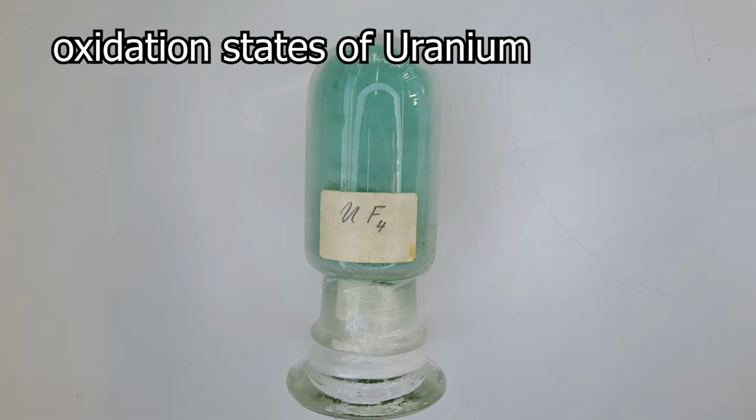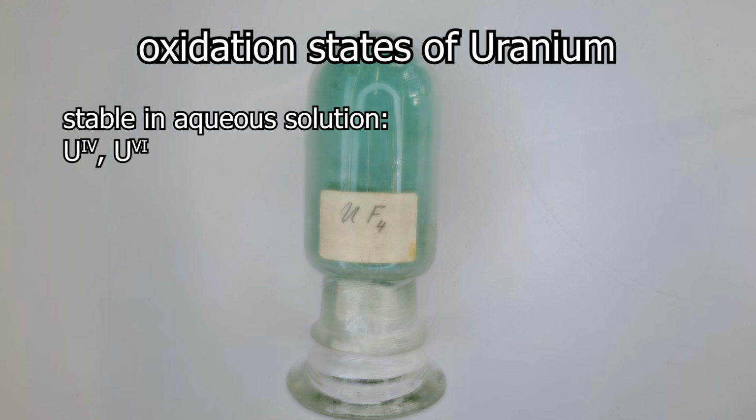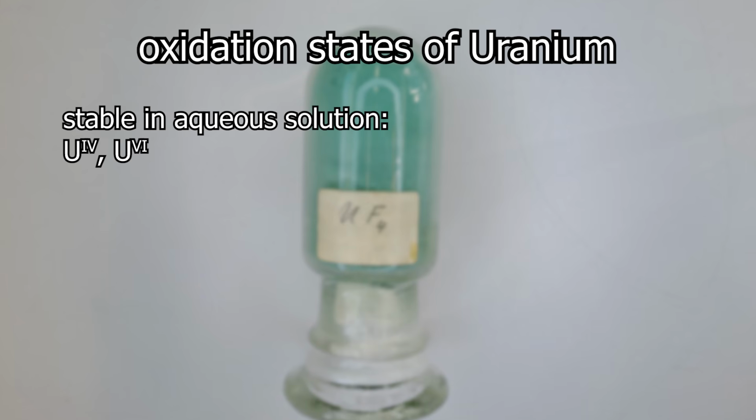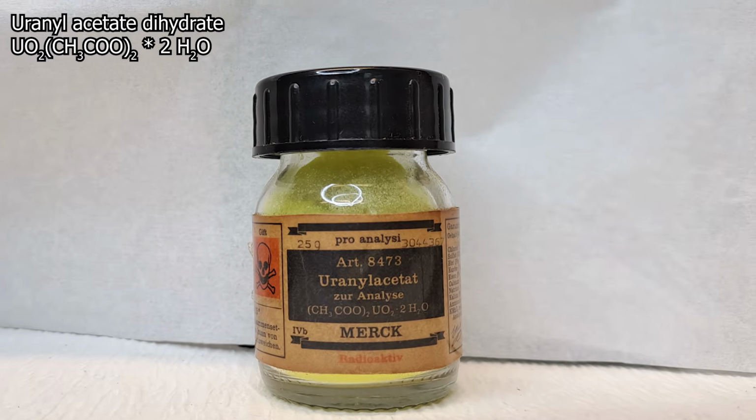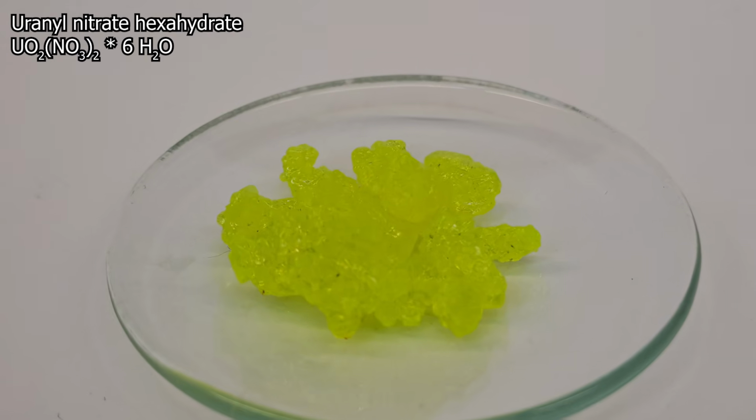In solution, uranium is the most stable at the oxidation state of +6 and +4. The other oxidation states are also known, but from all of them, hexavalent uranium is the most stable chemical form in an aqueous solution. It exists as the uranyl ion, and all of our highly water-soluble chemicals also contain the uranium in the +6 oxidation state. We have uranyl acetate and uranyl nitrate hexahydrate here in the lab.